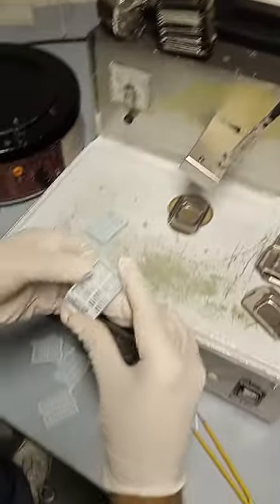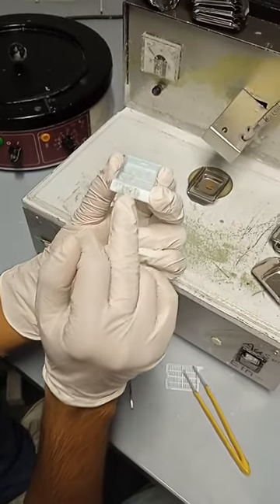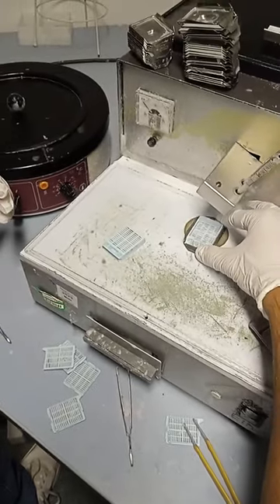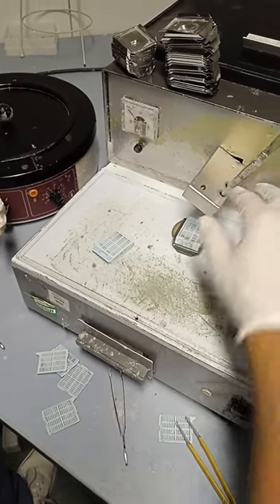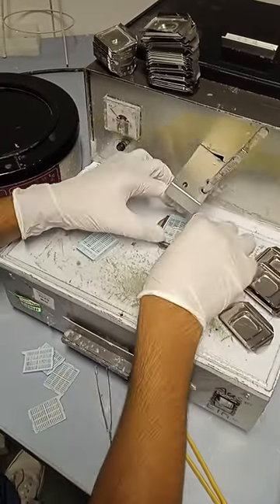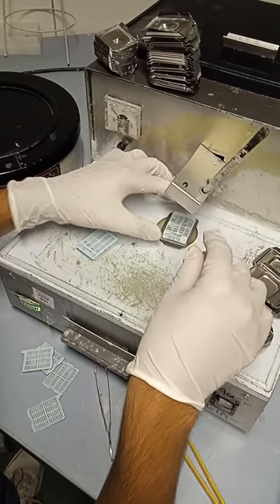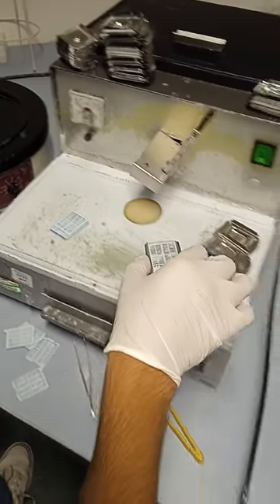Afterwards, you will use the remaining cassette part. It's very important that you label these cassettes with a pencil. You will put them on top like this, and add more paraffin — good — and then place it on the cooling machine.